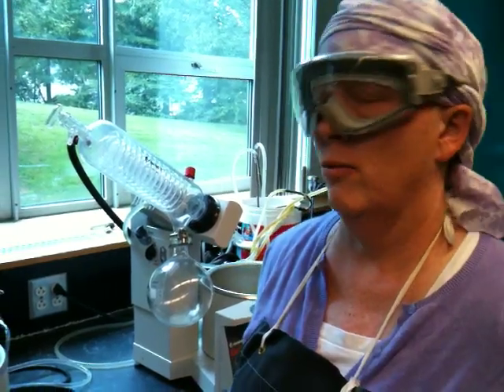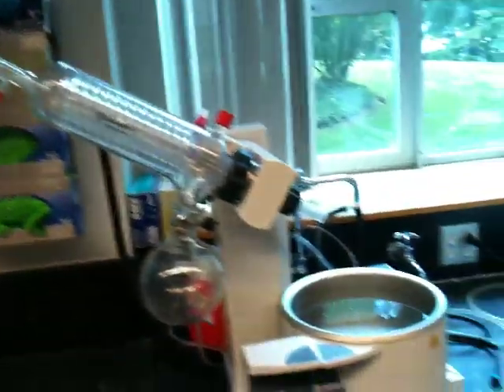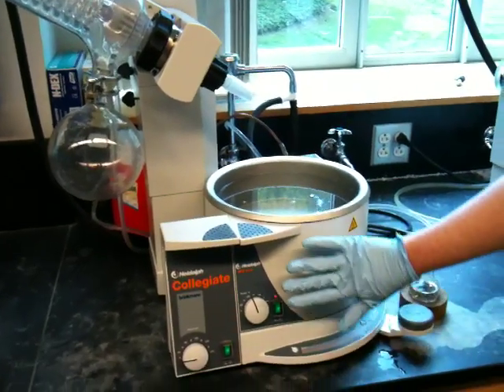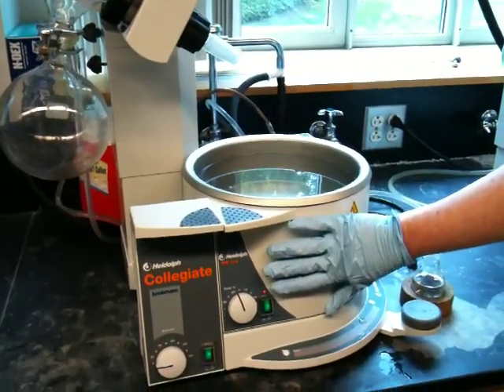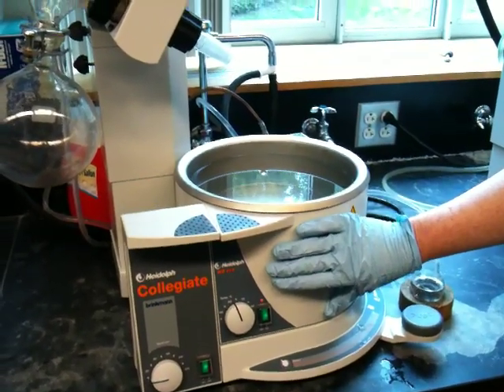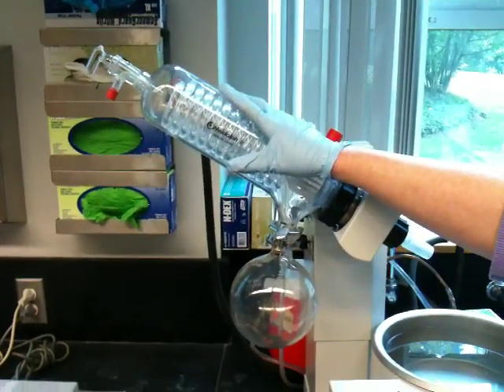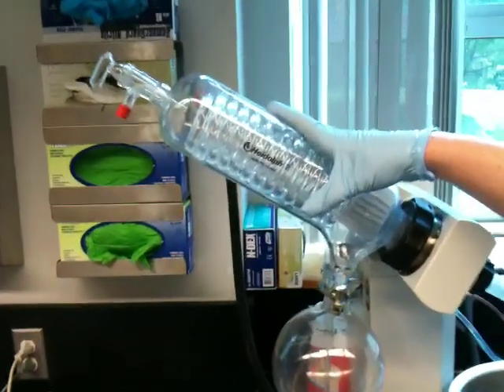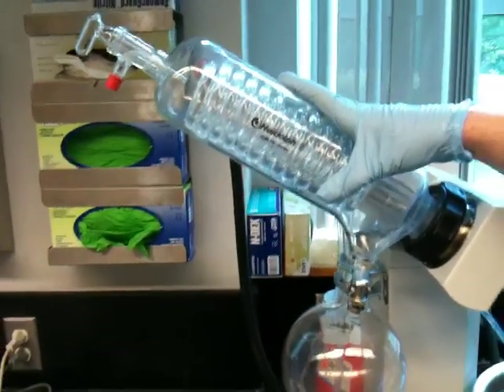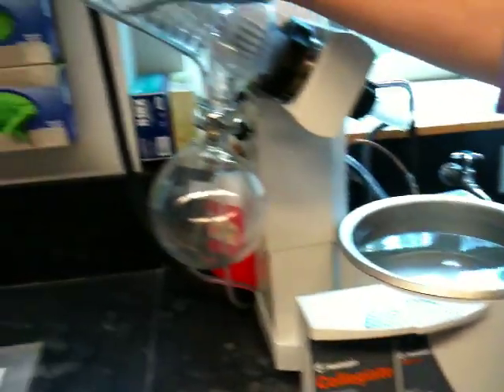The rotavap is a research grade piece of equipment, and you can take a look at the various rotavaps we have. This is one of our newer rotavaps. Basically what they consist of is a water bath, and that's a heater — this takes the place of your flask heater in a distillation. A condenser, a very high capacity condenser, which has many coils and can very efficiently condense liquids, and a receiver that's built in. So this is where your pot goes, this is your condenser, this is your receiver.